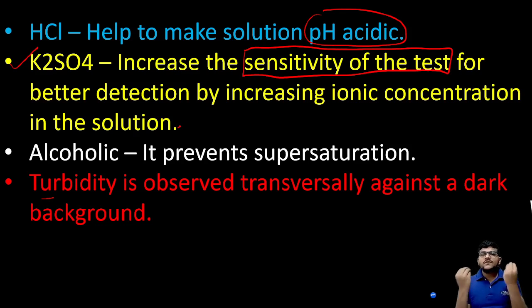So both Nessler cylinders, test and standard, will look like they have equal turbidity. Then you would say to your professors, sir, the limit test is showing no result, I think there is an error in the limit test, or an error in the method of preparation of the standard as well as the test sample.